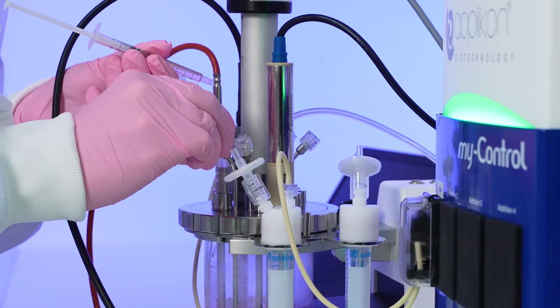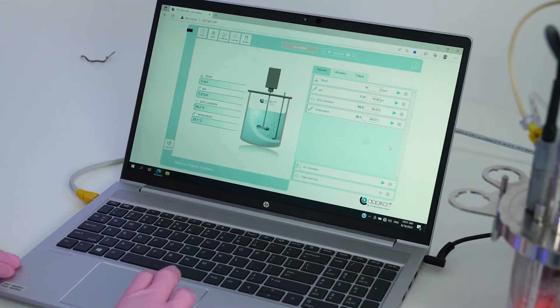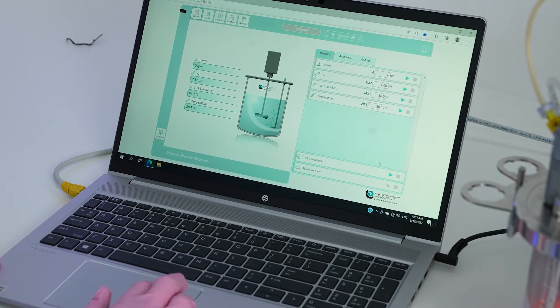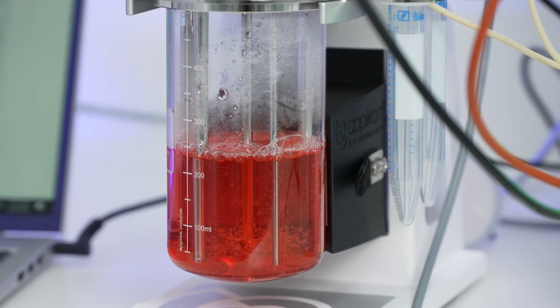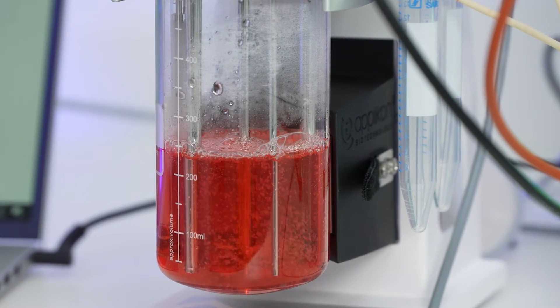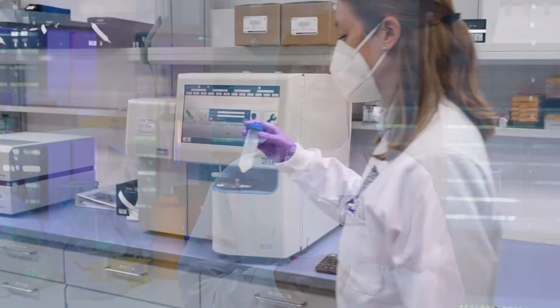We want to learn that the cells can adapt to any stirring environment, or the environment that the bioreactor can control. Because the bioreactor has all these sensors incorporated, we can also use those automated monitoring technologies to check if the cells are growing. Are they happy? Are they proliferating enough? And when is the right time to harvest the cells?